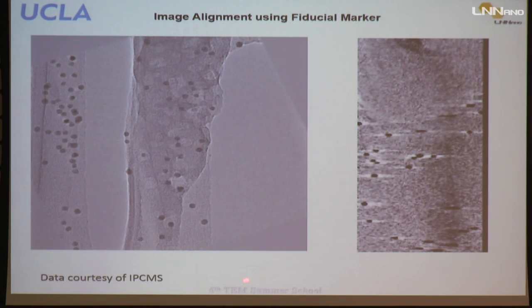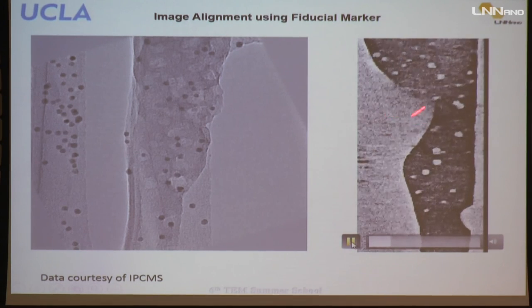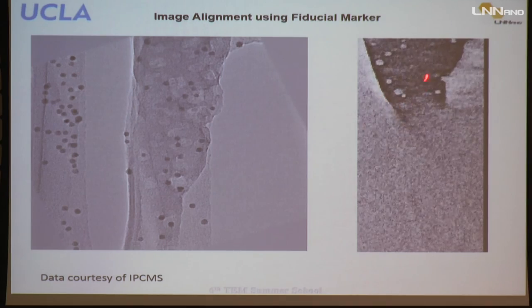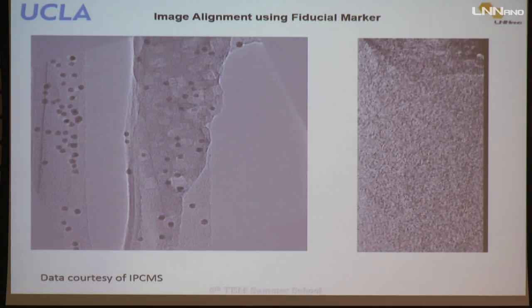And this is actually a porous material, and this is a reconstruction. It's a porous material, so there are a lot of holes. You can see holes inside this cube-shaped one. This you cannot measure with just 2D projections. This is one case where you do need 3D reconstruction to see where the holes are and what their size is.